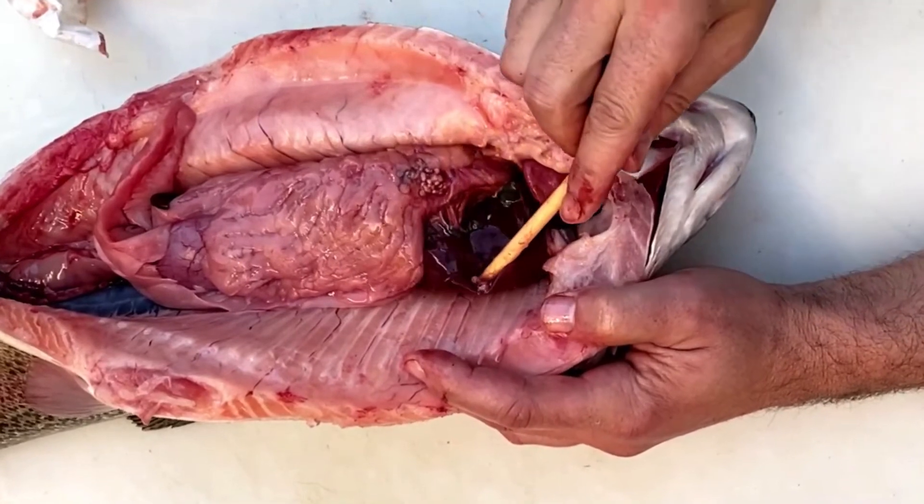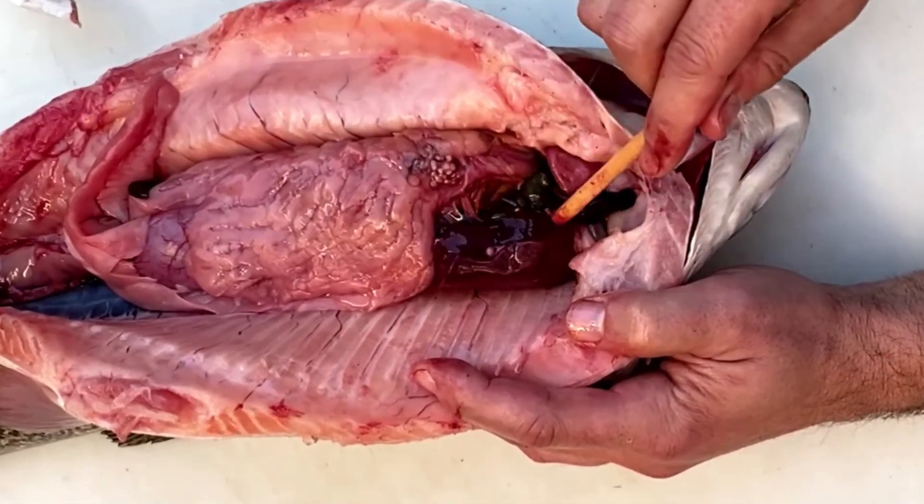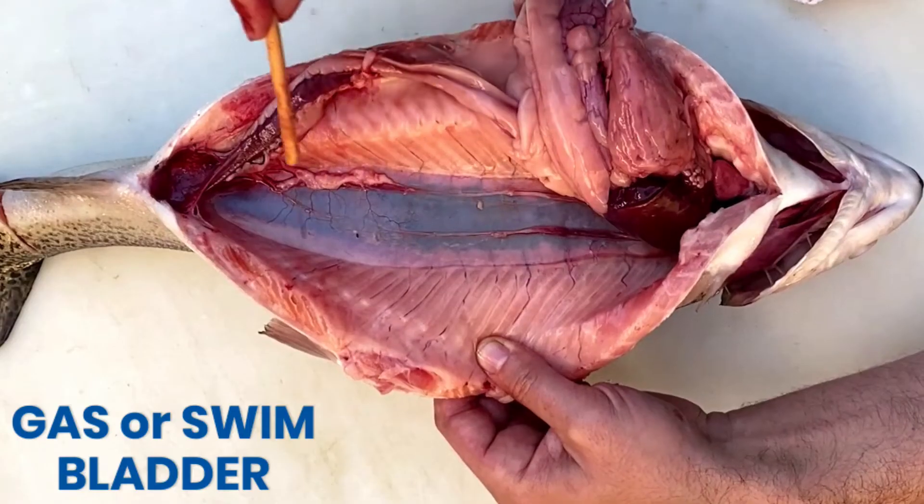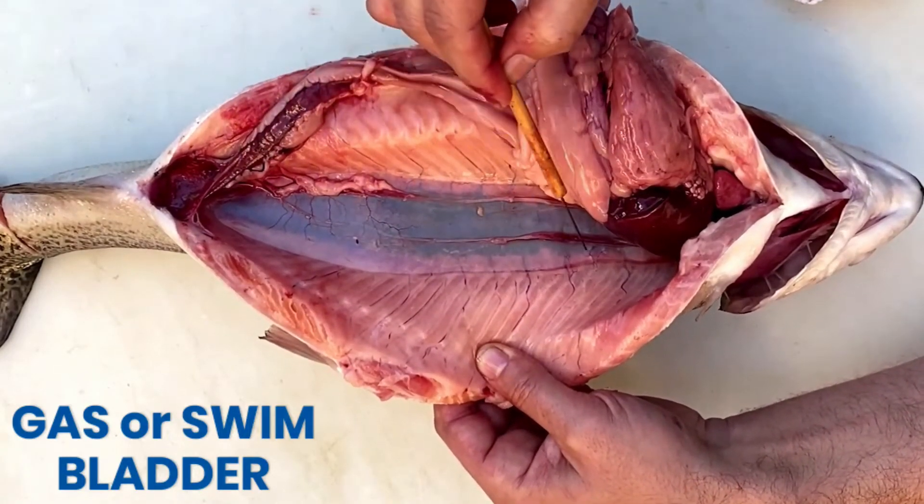To see the gallbladder, which is dark green in color, you'll need to tease the liver out of the way. Once the gastrointestinal tract has been moved, we can get a good look at the gas bladder.